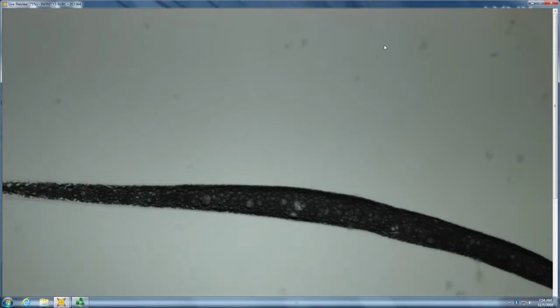So bubble hair, what causes bubble hair? Is this some kind of amino aciduria? I don't know. It's like this heat, right? Yeah, so it's your blow dryer shorting out, and instead of being red hot, the element is white hot, and you're turning your hair into popcorn. Well, that's somebody with really white bleached hair, perhaps. And this one would have been someone with pretty blonde hair.